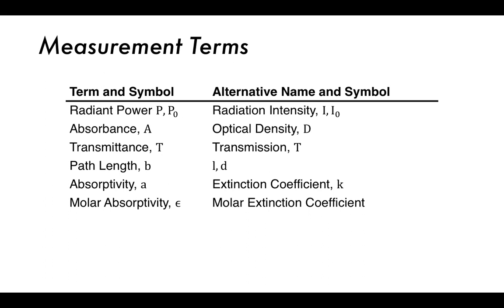It's often, though, reported as the molar absorptivity, so it's the absorptivity per mole of a particular substance, also known as the molar extinction coefficient, both of which have the letter epsilon. It's the factor which is molecule or species dependent, which we're going to see used. So it's kind of like a correction factor for a measurement based on the particular behavior of our analyte.